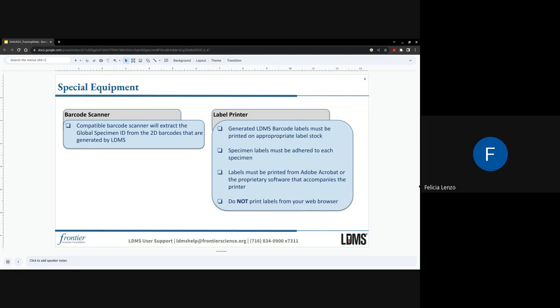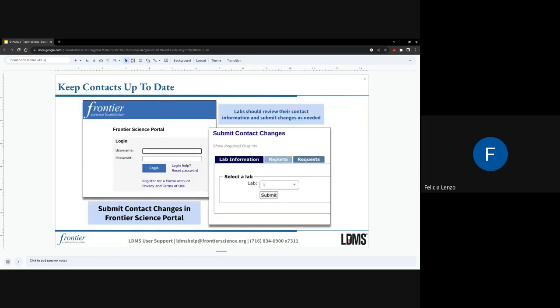We will walk through label printing and how to verify labels have been printed successfully later in today's training. As a reminder to any lab administrators or managers: please keep your laboratory contacts up to date by accessing the Frontier Science portal and navigating to Submit Contact Changes. Labs should review contact information and submit changes as needed, especially if there are changes to personnel — shipping contacts, query contacts, or any personnel turnover.